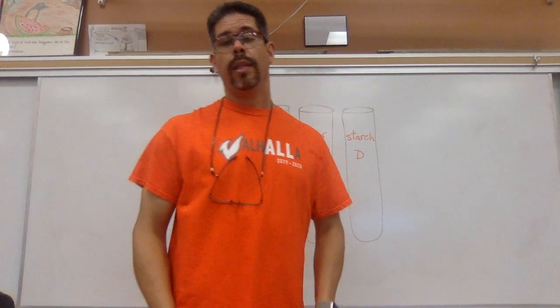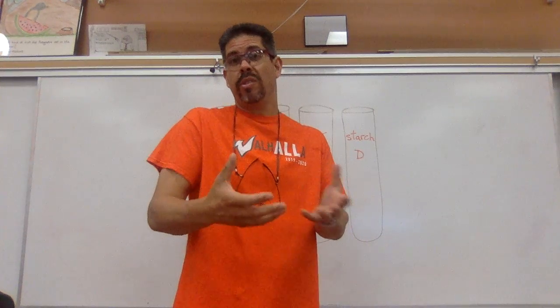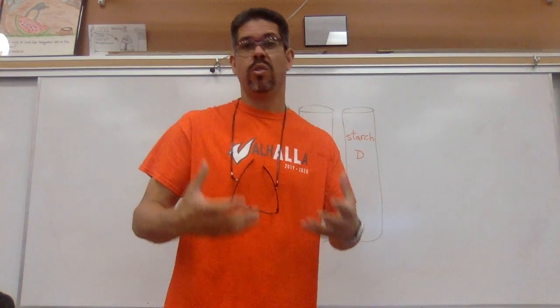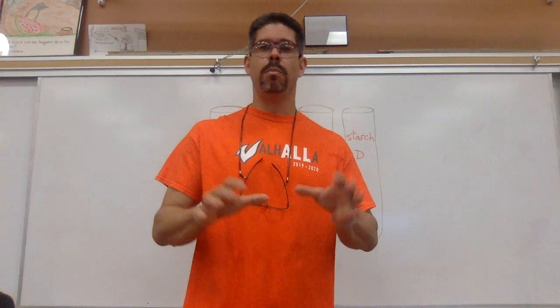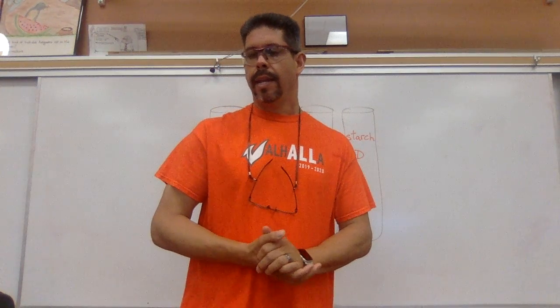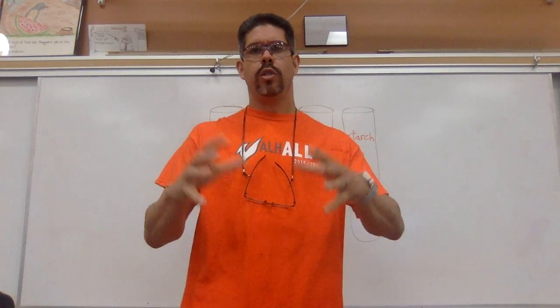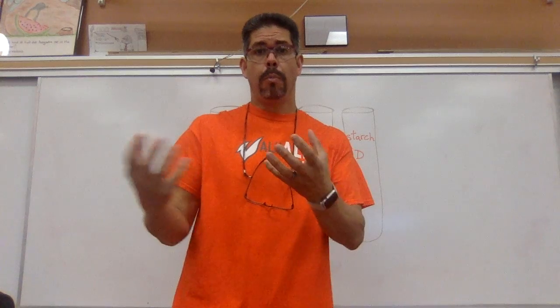I just wanted to do a quick lab demonstration video to show you how scientists can check food to see if there's something like proteins or starch or sugar in there. We're going to focus mostly on starch today just because it's a simple demonstration and it's quick and easy to do. But just really quickly before we do that, I want to make sure that you understand how these macromolecules are put together.